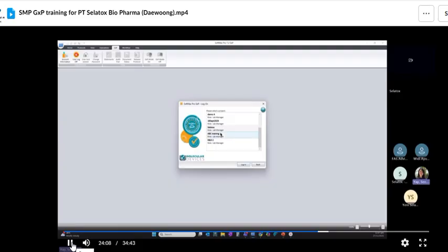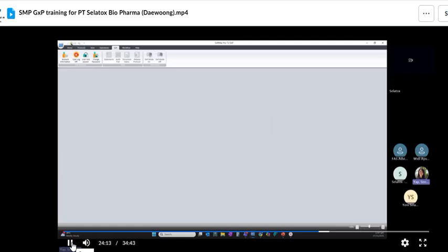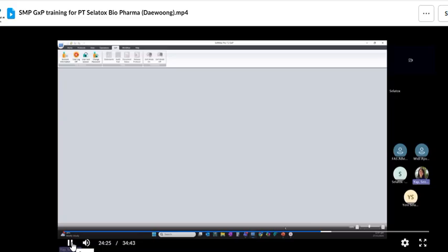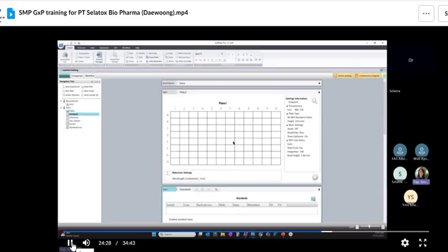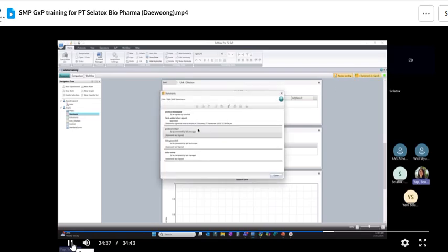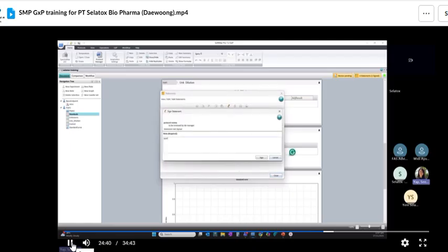Then look for the project. So which is this one. Okay. When you log in, you go here. So you will see this file pending for review. Review pending, right? So which is you as a lab manager, you log in. Then you just cross-check the data and so on. If you're happy with this you want to make it as an official protocol, right? You can go ahead to the statements here. You can say approve or whatever comment, and then confirm your username again. Okay.